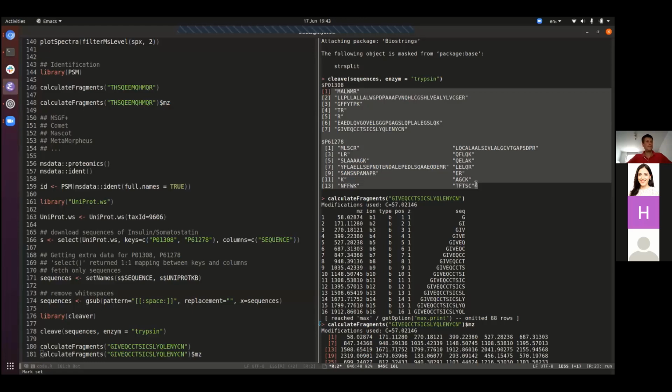So then the second component is empirically derived enzymatic fragmentations from known proteins, which gives known peptide fragments. And there's homology between the enzyme that we use for digestion in our sample versus what's publicly known, and that's generally trypsin, is that correct?